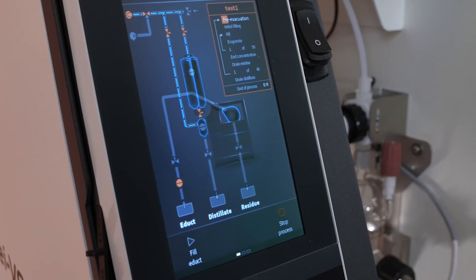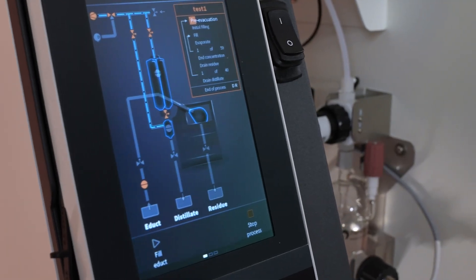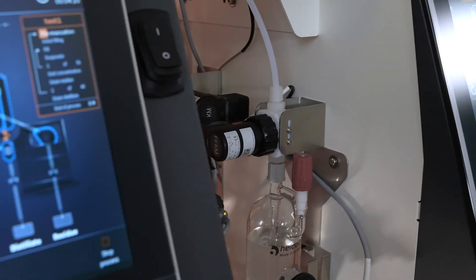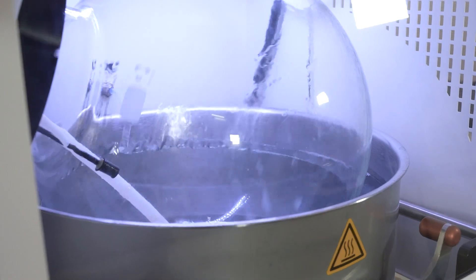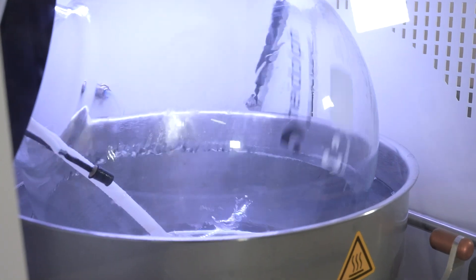It will also stop the process automatically as soon as the entire mixture is processed. The Distimatic Pro is not only available for benchtop applications but also for large-scale evaporators. This combination allows evaporating more volume at the same time — for example, with this setup you can process up to 1000 liters of hexane a day.